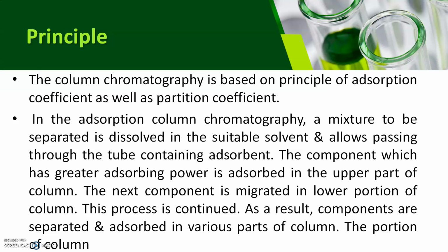Next point is the principle. Column chromatography is based on the principle of the adsorption coefficient as well as the partition coefficient. So it depends upon what type of stationary phase we use for the column chromatography. It may be partition coefficient based or it may be adsorption coefficient based.